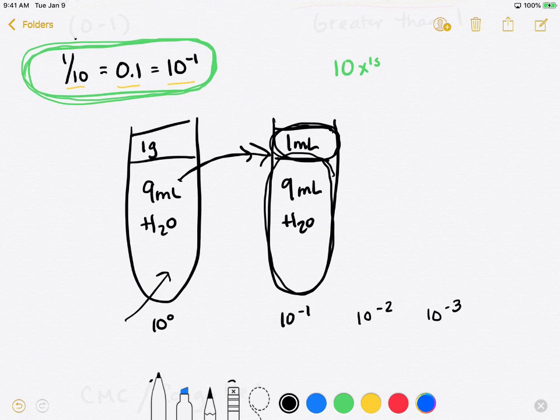The reason for diluting this is that there are so many microorganisms that live in the dirt. We were trying to dilute out those bacteria so that we could get a plate where there would be enough colonies that we could then view and analyze. So the purpose for the dilutions was simply that, to dilute the dirt so that we could see a reasonable number of organisms growing on the plate.